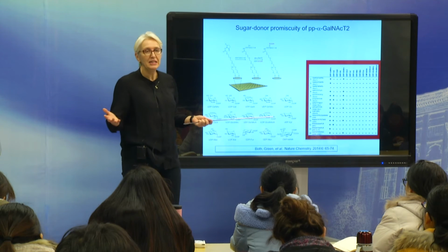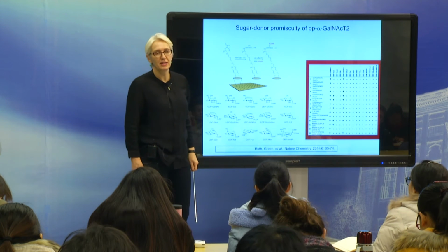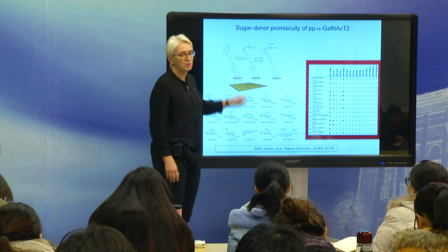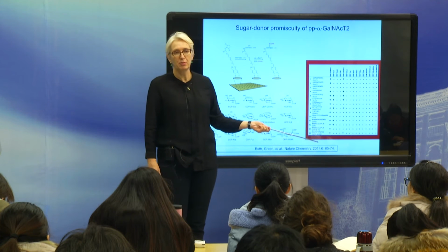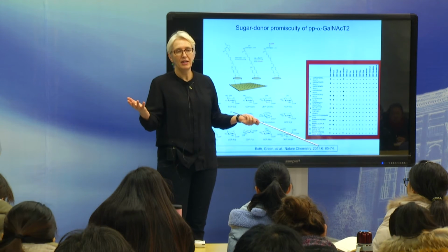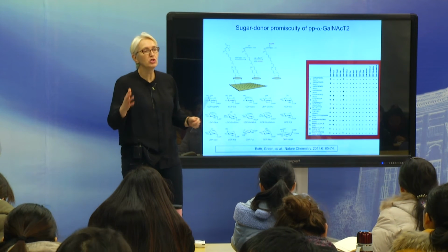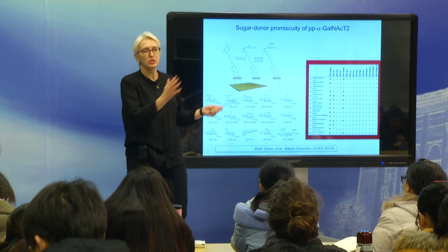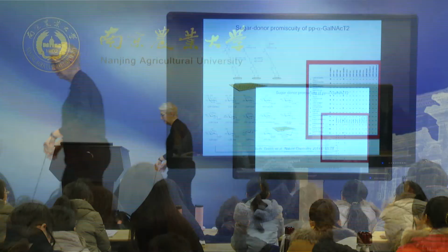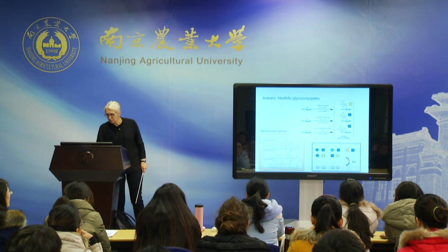And secondly, there's no technique really available to distinguish between peptides that have GlcNAc and GalNAc, because all the analysis is done by mass spectrometry, and people learn the rules. This enzyme always puts UDP-GalNAc onto the first peptide, so they incorporate that biosynthetic knowledge into their sequencing analysis, and then assume if they see a HexNAc, it's GalNAc. And this shows you that it is a little bit dangerous to use these sequencing protocols, because you just always assume that everything in the literature is correct, and it not always is. So that's what really got us into using this ion mobility mass spectrometry.